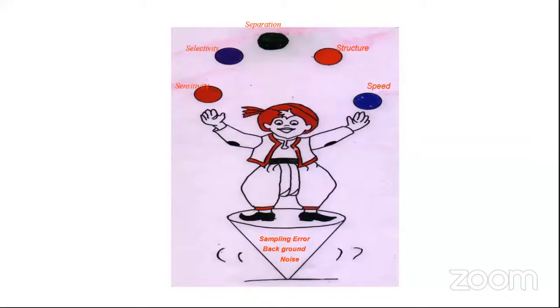The analytical chemist always talks about this. And what is so important about all these 5S with respect to mass spectrometry is that the mass spectrometer, along with GC or LC, gives you all the 5S, including the structure, because GC alone or LC alone cannot give you structural information. But when you have a combination of GC with MS or LC with MS, you get structural information about the molecule. And then you have much better sensitivity, because you can find out the structure of a molecule at very, very low level.